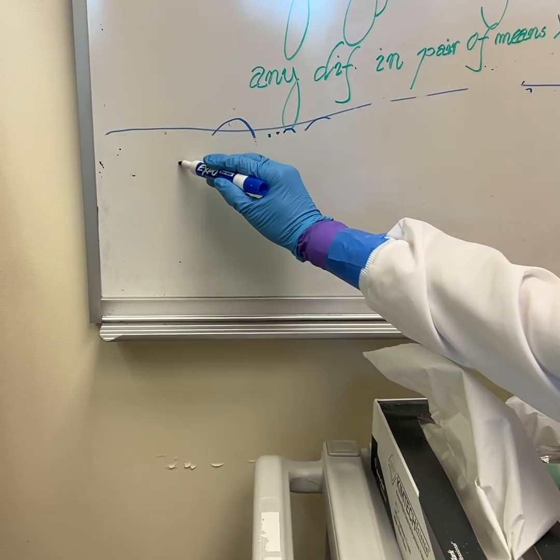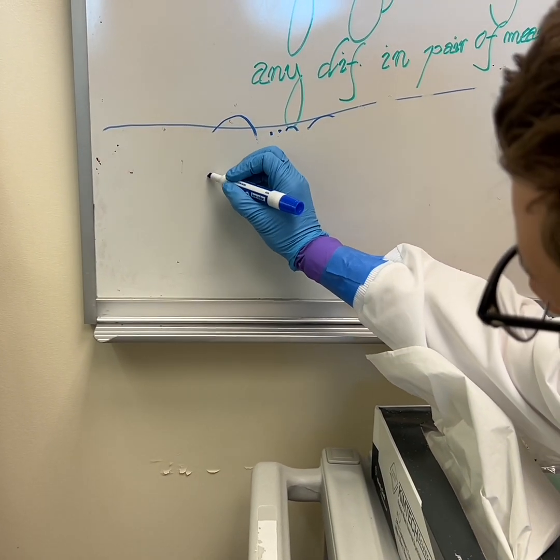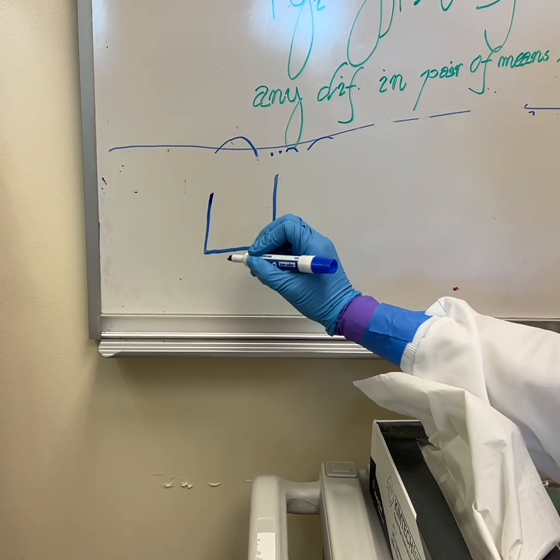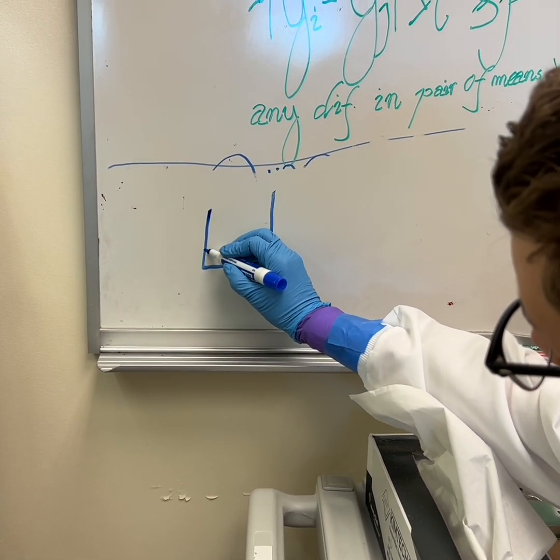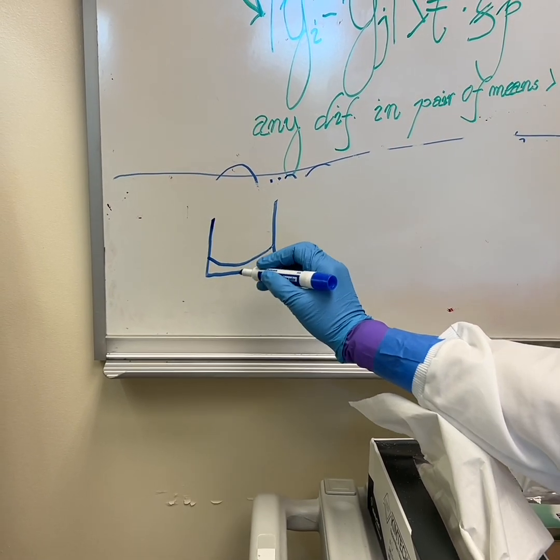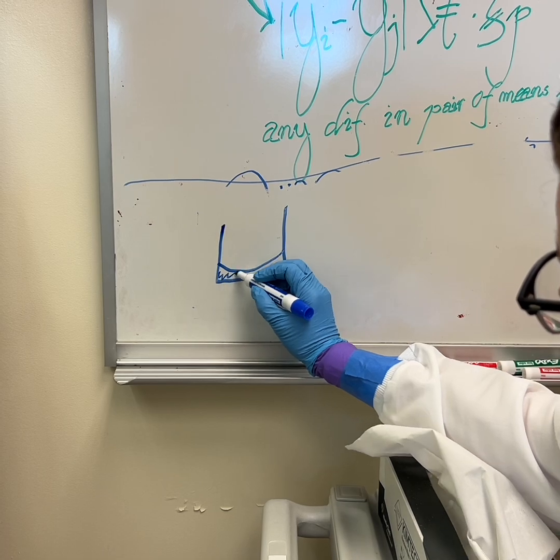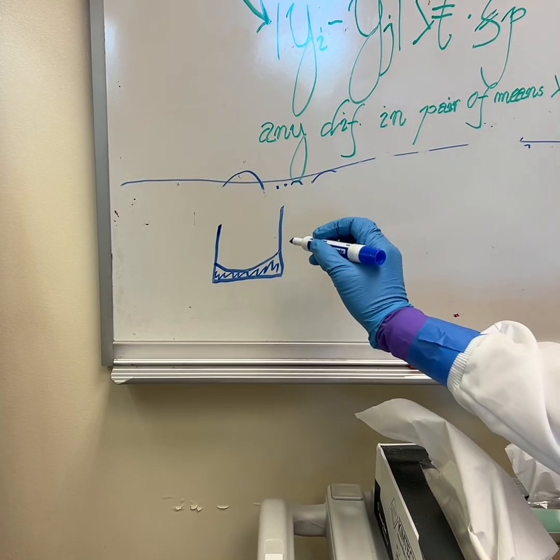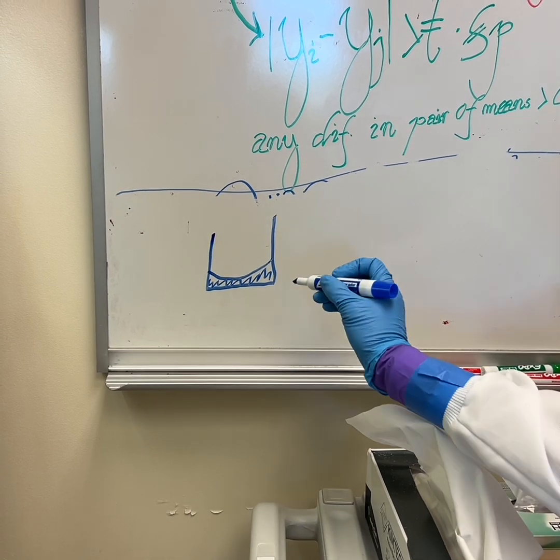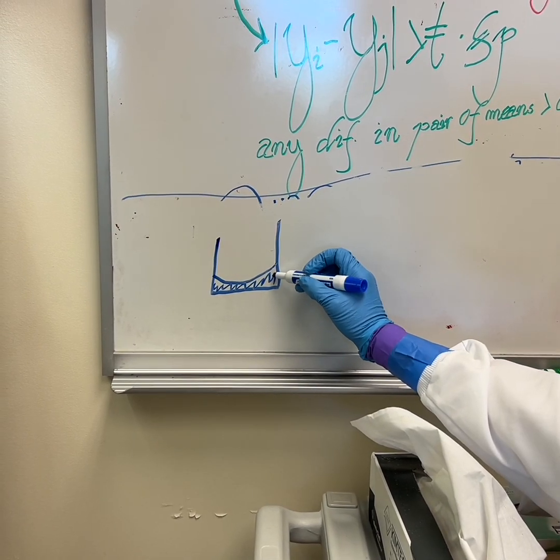Depending on how long you incubated it for, it may be more apparent or less apparent, but regardless, there's going to be some sort of biofilm formed on the bottom of the well by the yeast. Okay, and so when we're aspirating, washing, and doing our serial dilutions, you do not want to disturb this biofilm.